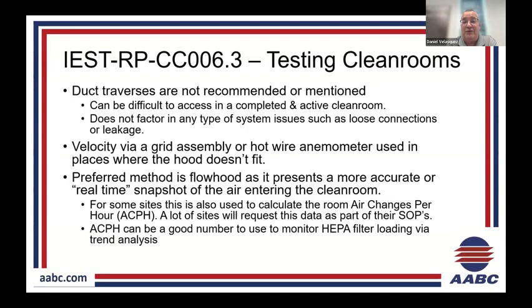You go through and test the airflows. Obviously, they'll have their HVAC guys go through and PM the units. So they know if the units aren't degrading, it's the HEPA filters starting to load. So that's a good gauge that they'll use, the air change rates. Critical in hospital pharmacies, through USP 797 and 800, they actually put in pass and fail rates for air changes in those rooms. For the longest time, it was always a recommendation. Now it's a requirement. Based on the room classification in a hospital pharmacy, they do have required air change rates that they want to see now.